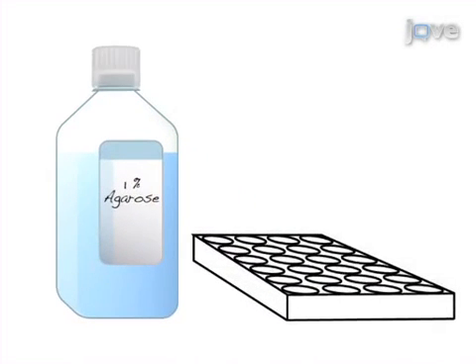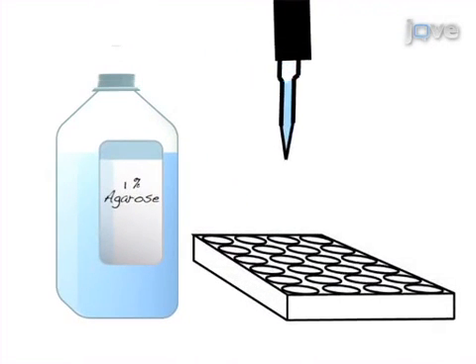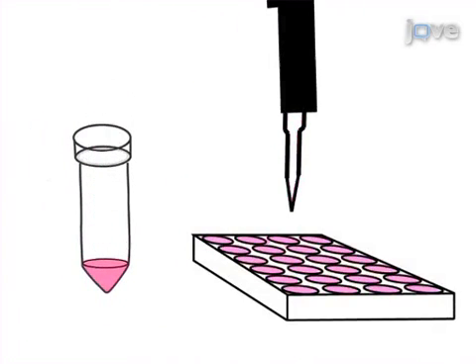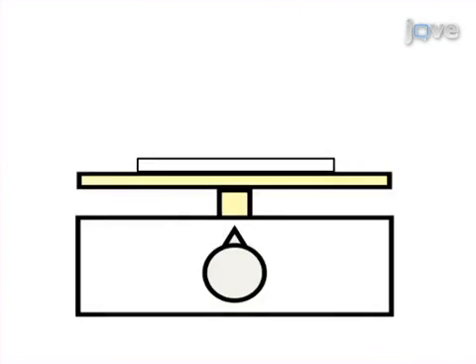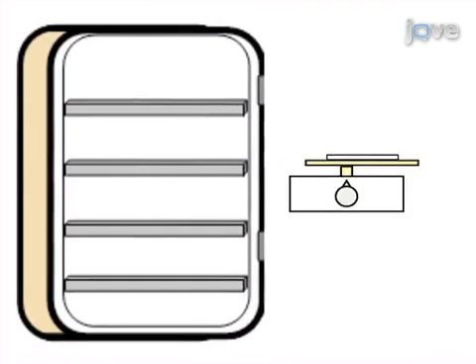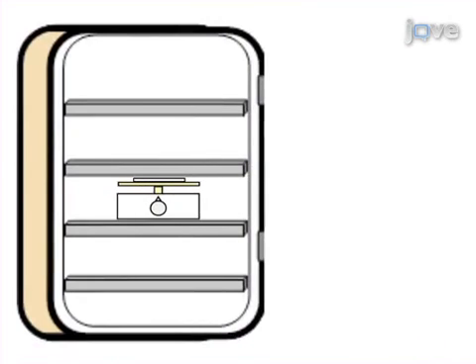This is achieved by evenly coating 24-well plates with agarose on which human neuroendocrine tumor cells in a single-cell suspension are seeded. The plate is then incubated on an orbital shaker in the incubator overnight at a speed lower than 40 rpm and then transferred to a stable shelf in the incubator.